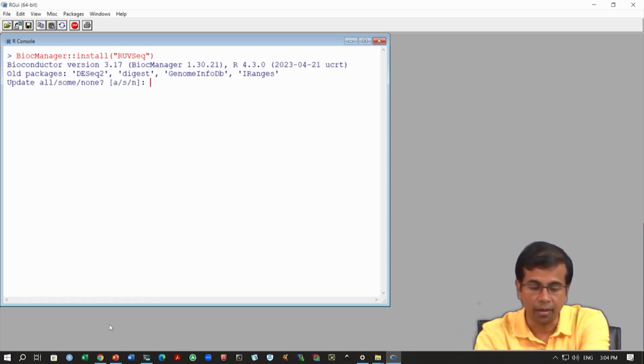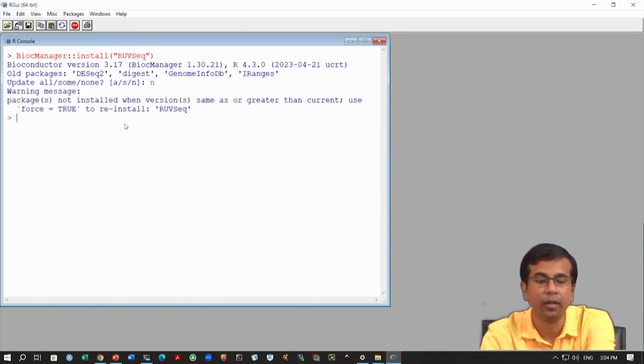Okay, so this is actually already there, probably I do not want to update any packages at this moment. So, it is telling me that this package is already installed. Okay. So, if it is not, then it will install step by step.